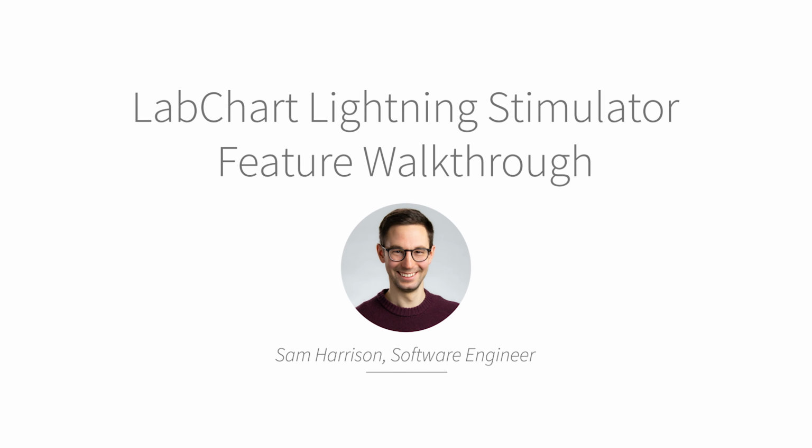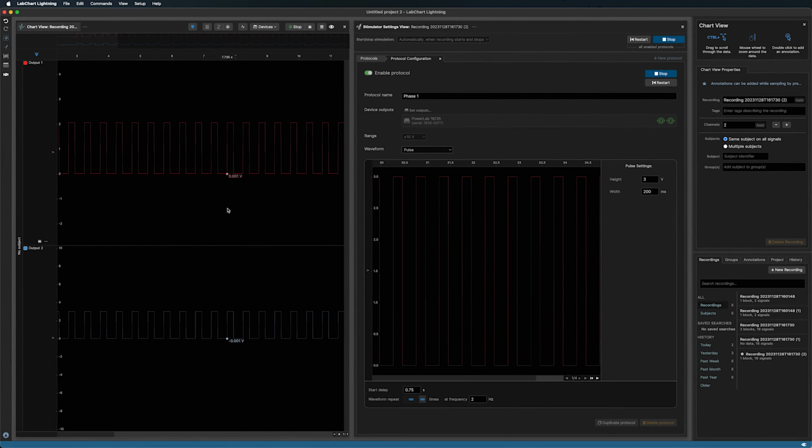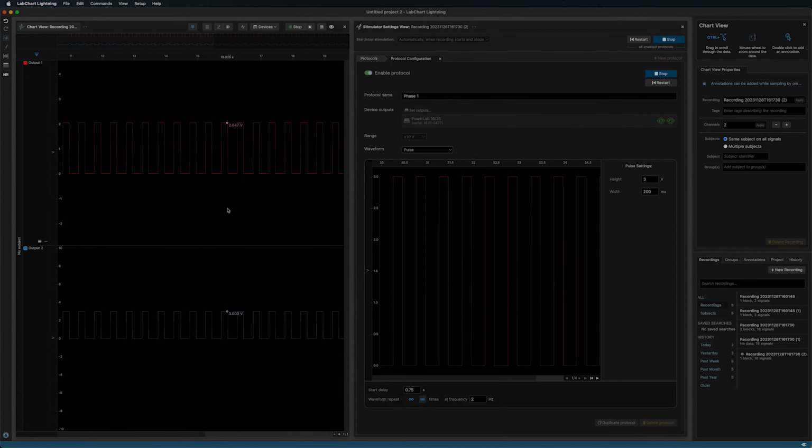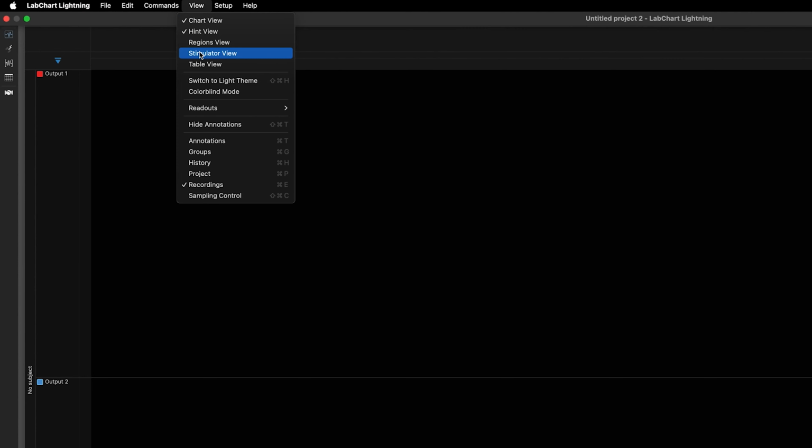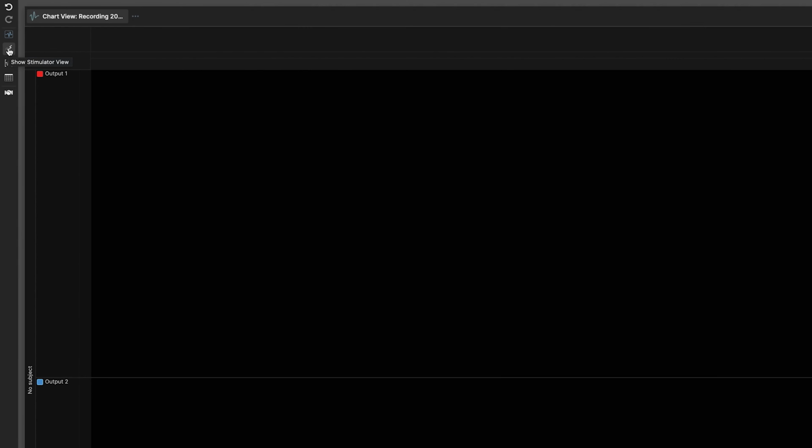Hi, I'm Sam. In this video, I'll show you how to use the stimulator feature in LabChart Lightning. The stimulator feature can be used to deliver electrical stimulation from a PowerLab to a variety of samples and subjects, or to trigger external devices. You can access the stimulator panel from the View menu and the toolbar.